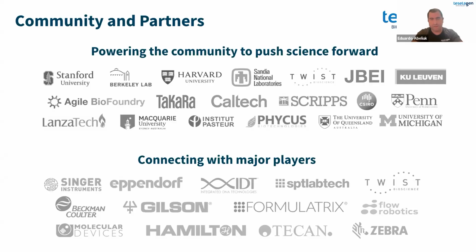We're also very proud to have built this platform in close collaboration with a diverse network of scientists, with leading companies and institutions, ranging from startups to larger companies, and to national biofoundries, working across multiple biotechnology sectors. Along the way, we've also integrated with some of the leading technology providers in the field, creating a truly connected ecosystem for modern biological R&D.